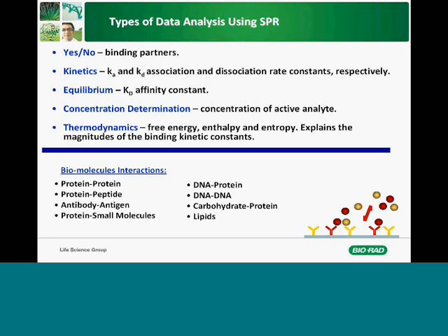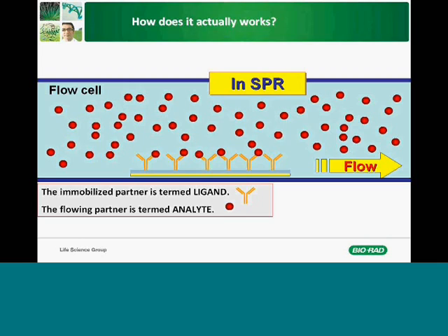So I just want to show 2-3 slides and to lead you to the main feature of the ProteOn and the benefits of it. So 1-2 slides before that. So how does it actually work? How does an SPR instrument work?